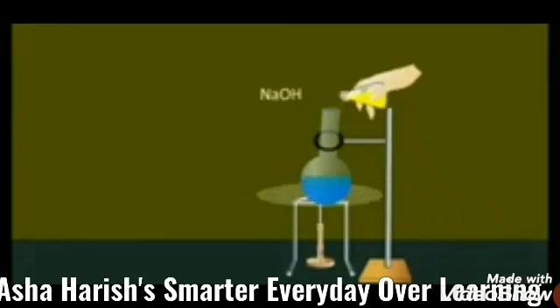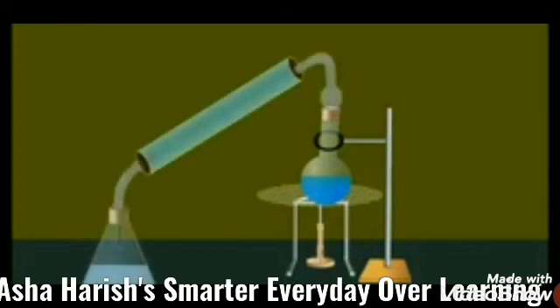And now NaOH solution you need to add to that particular solution you have taken in that specific Kjeldahl flask. After that, heat gently that complete solution, and again we have to connect one condenser.